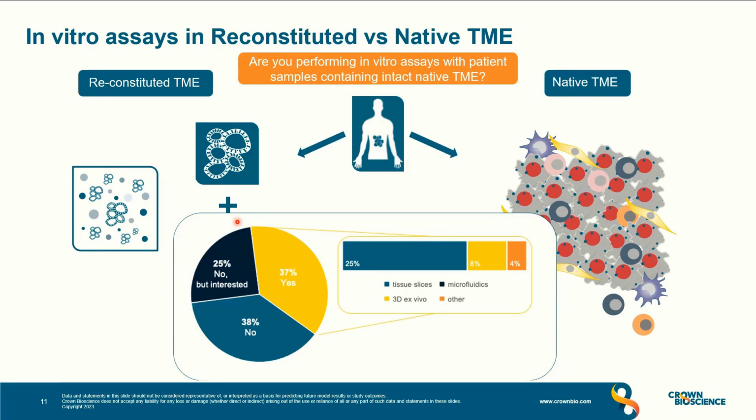Here are the responses that we've got from you. 37% of the responders have been using the native TME assays in the past, with the majority focusing on tissue slices and 3D ex vivo assays. Today, I will show you some examples of such assays from the literature, as well as from our own research.